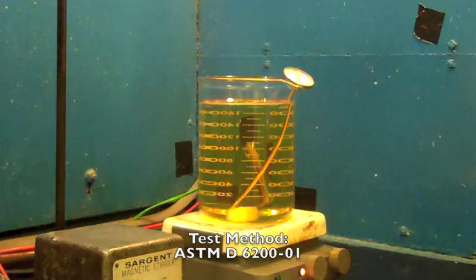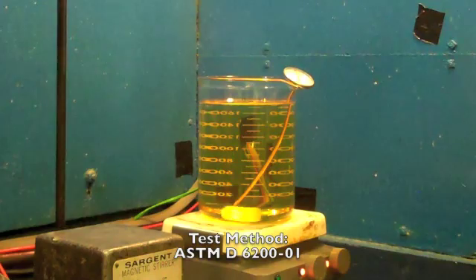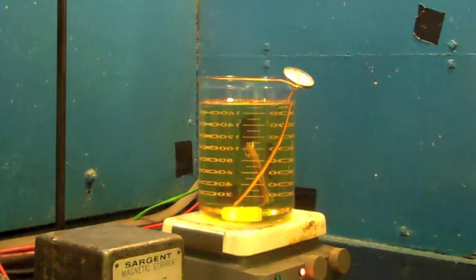This is a test demonstration of ASTM D6200-01, which is a standard test method for determination of cooling characteristics of quench oils by cooling curve analysis.